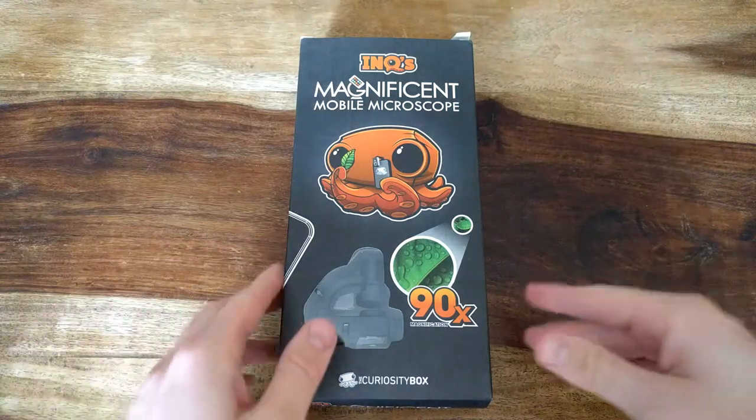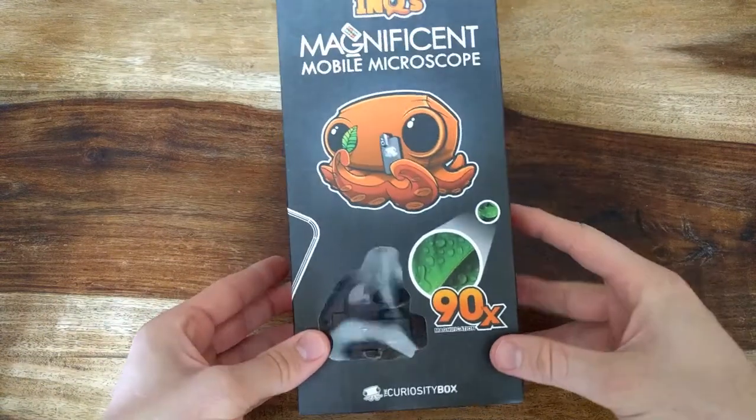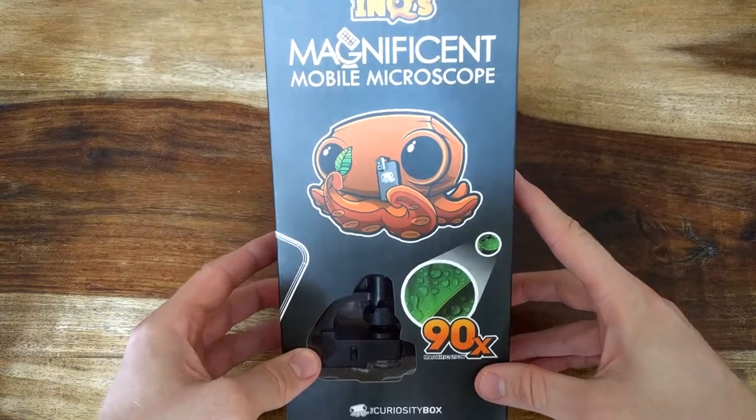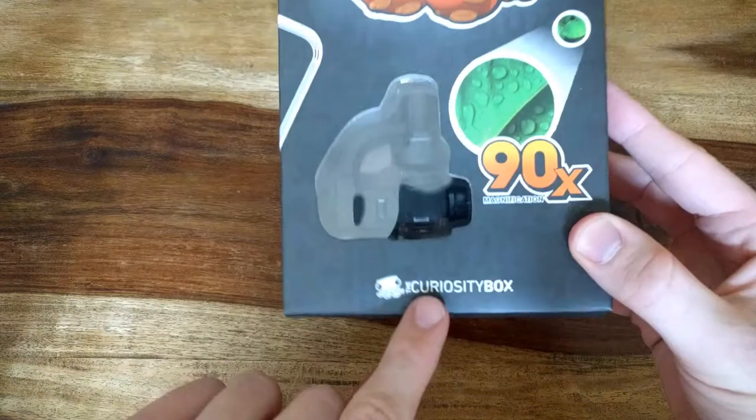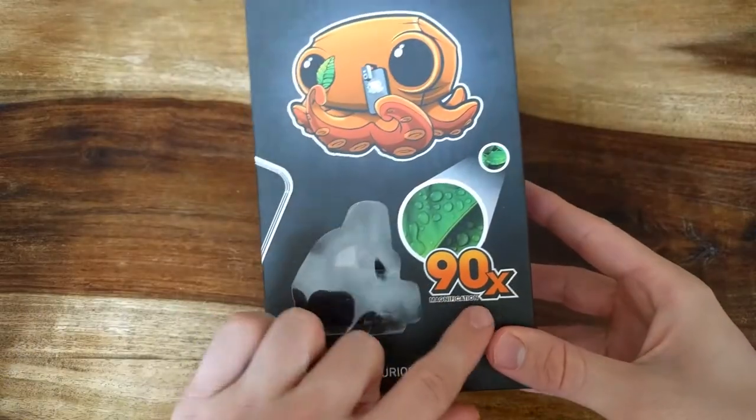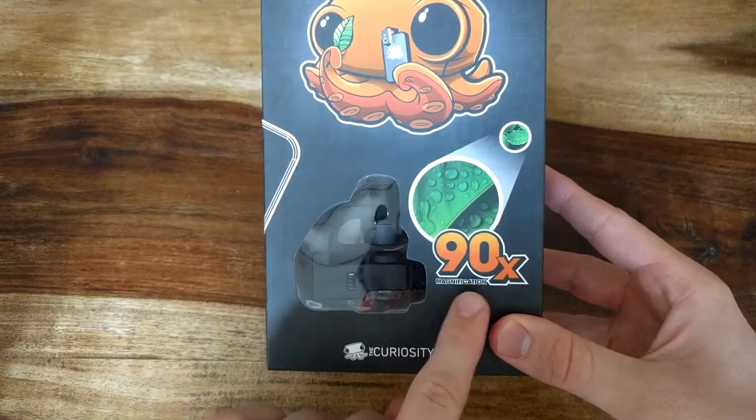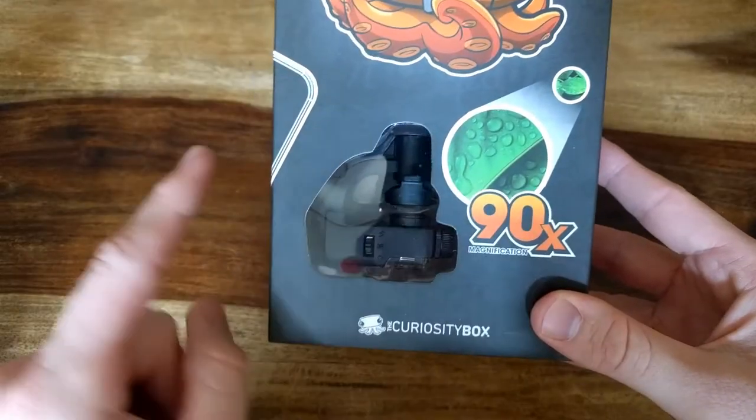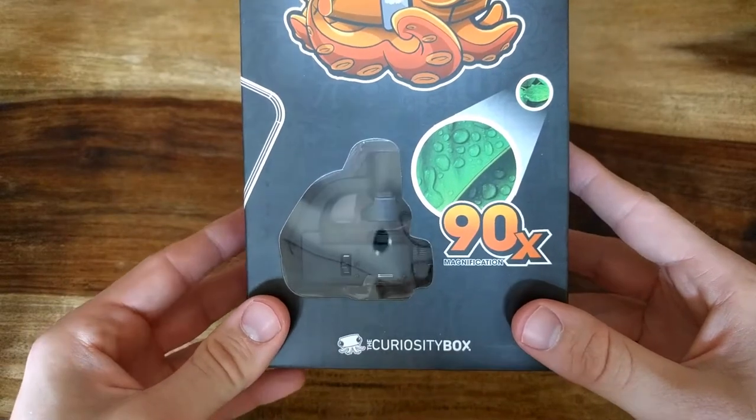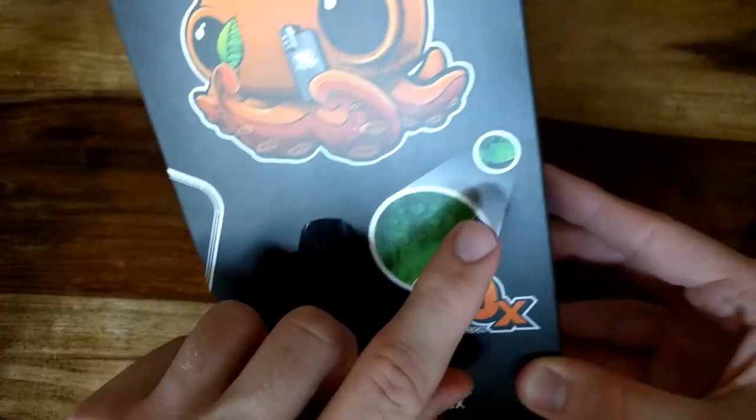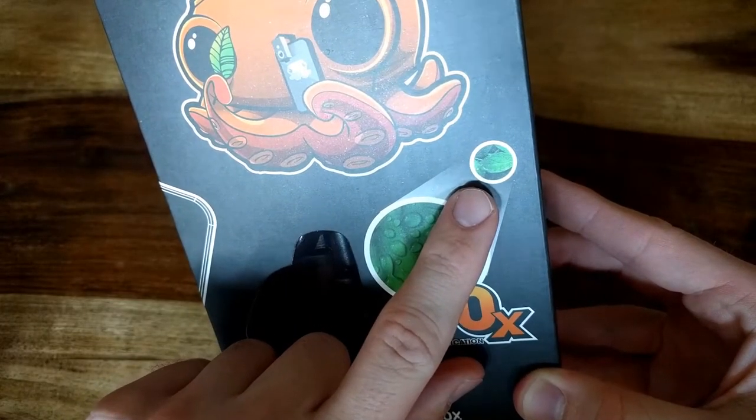This is a review for the magnificent mobile microscope by the Curiosity Box. As the package says, it should magnify the image by 90 times, so it is 9000 percent. This is what the original image should look like, and this is the magnified image.